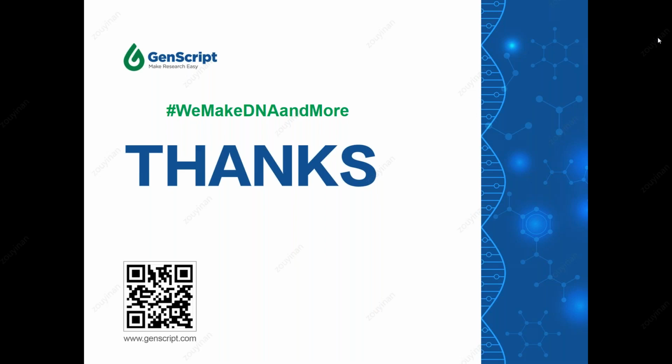The third piece would be, if a clone library is the final product, we need to know the backbone information. We have about 153 IP-free vectors that can be used as the backbone for free in GenScript. If the vector of choice is outside of these 153 vectors, we need to know at least the vector sequence for evaluation.